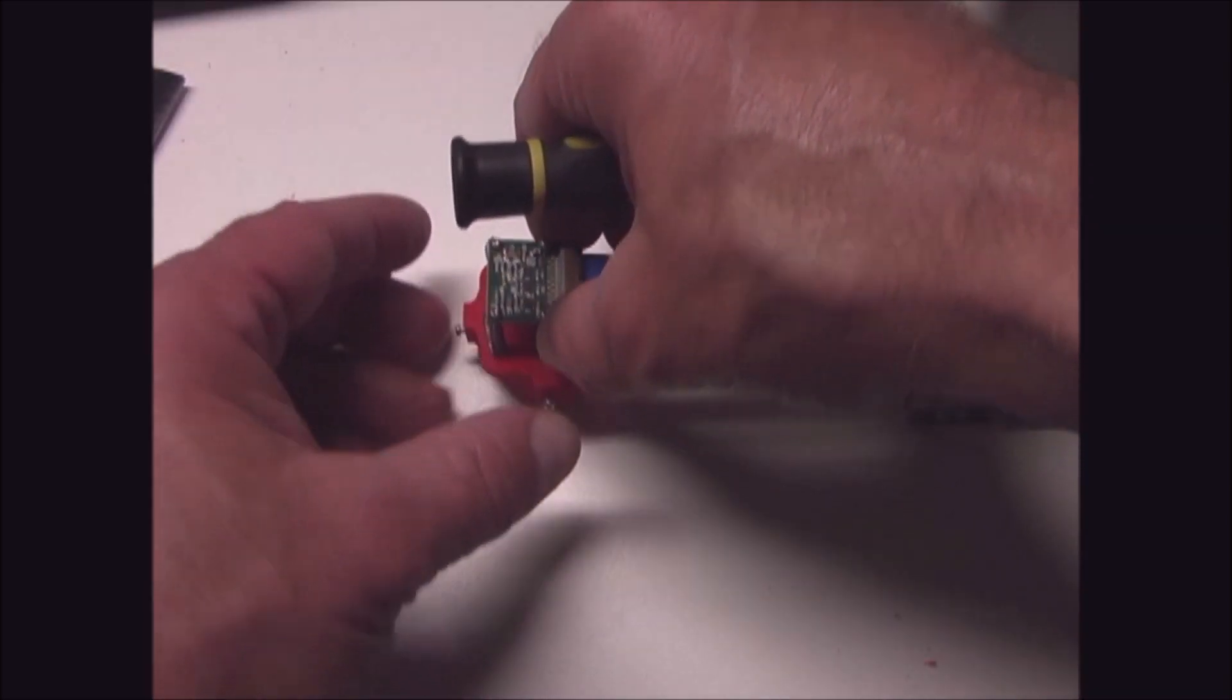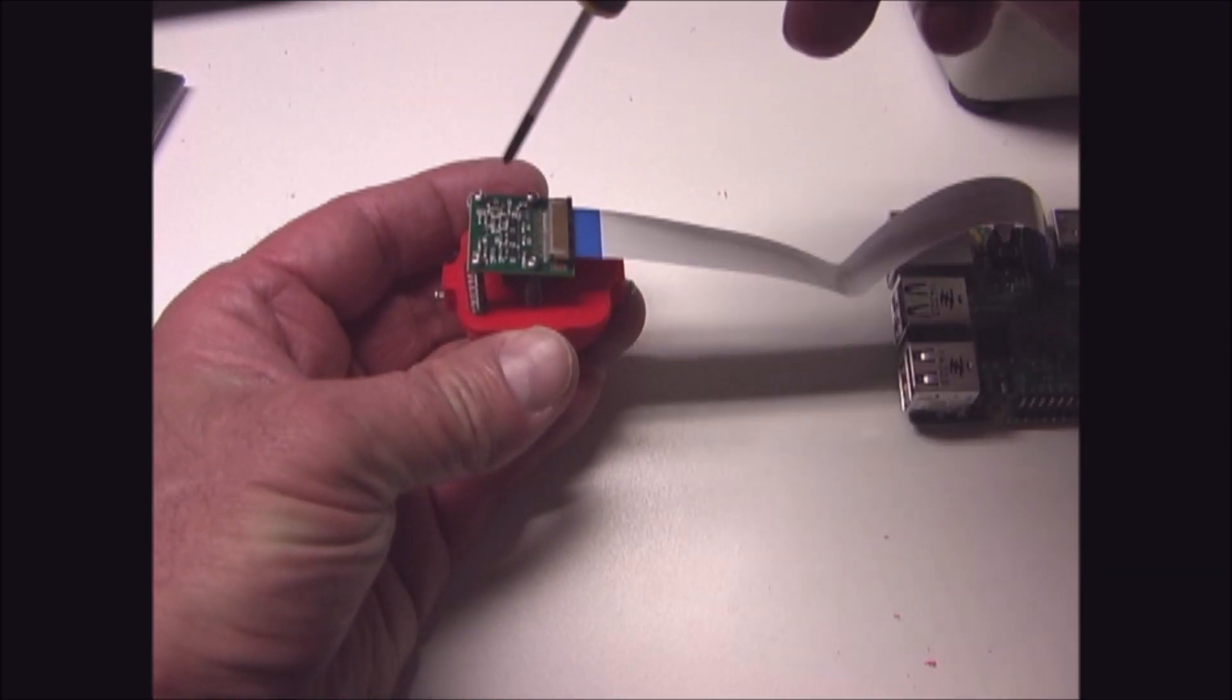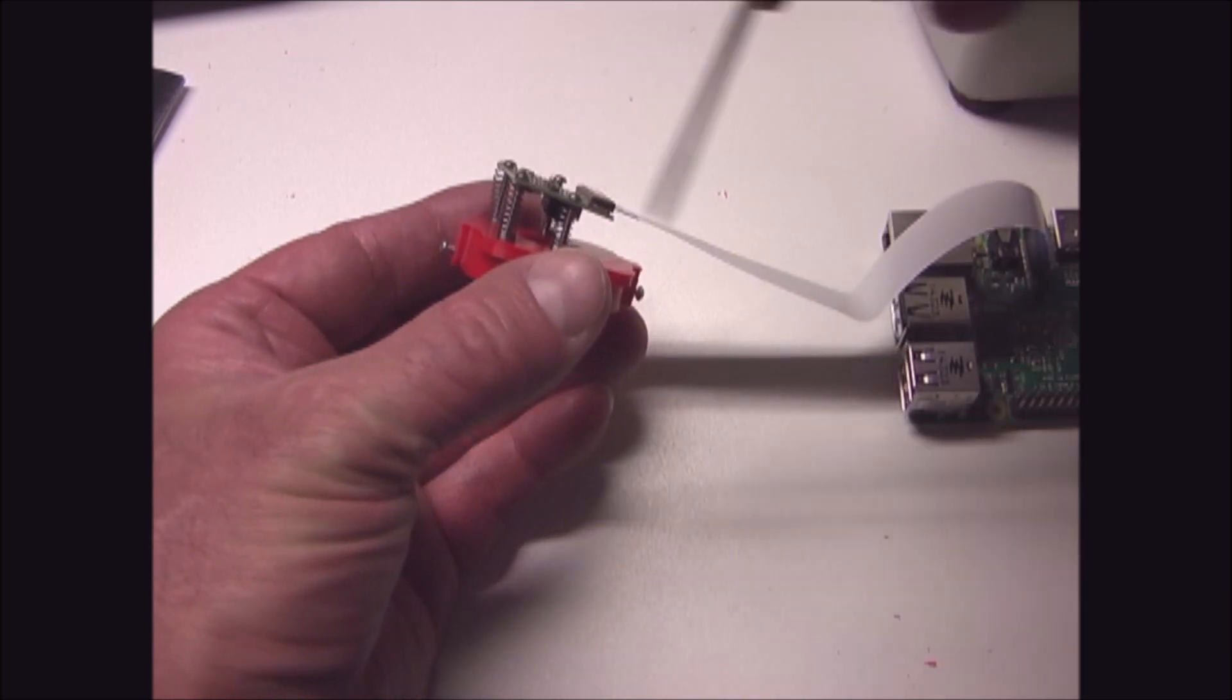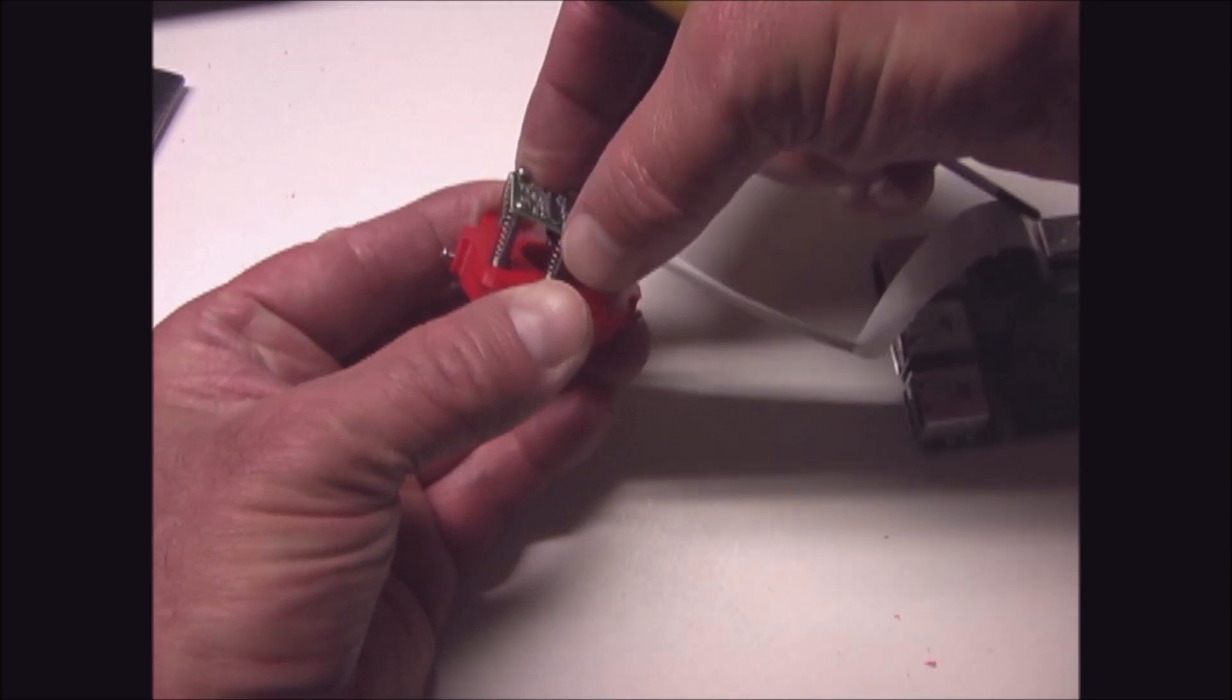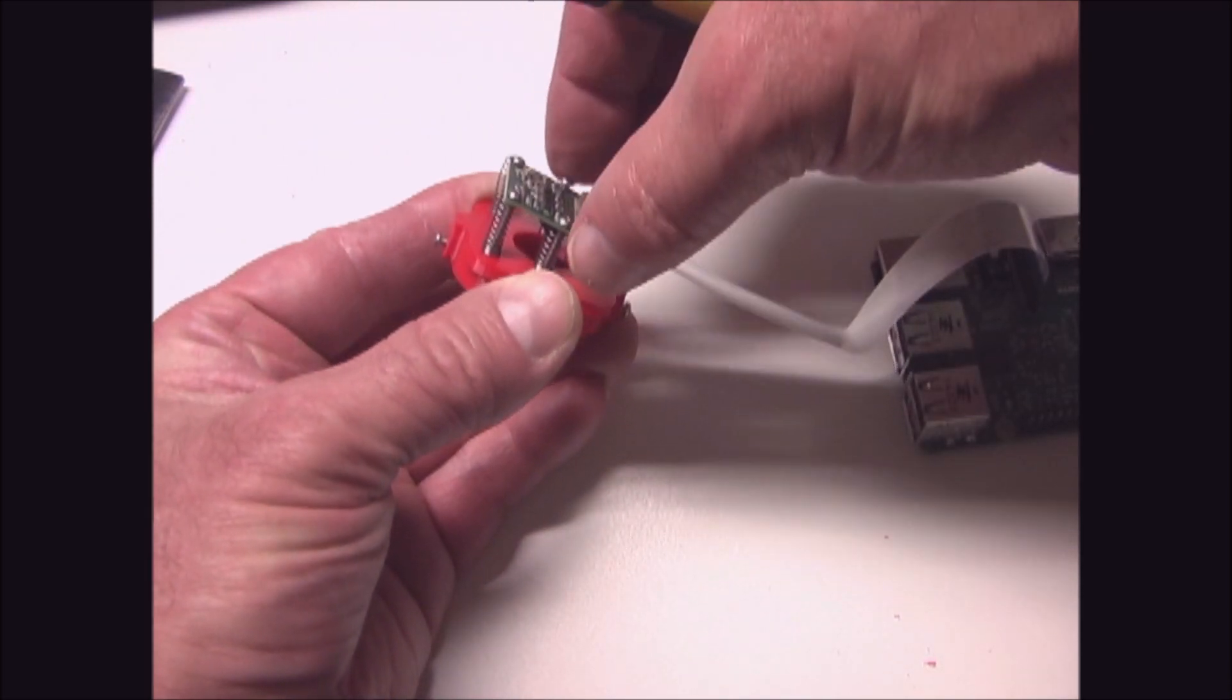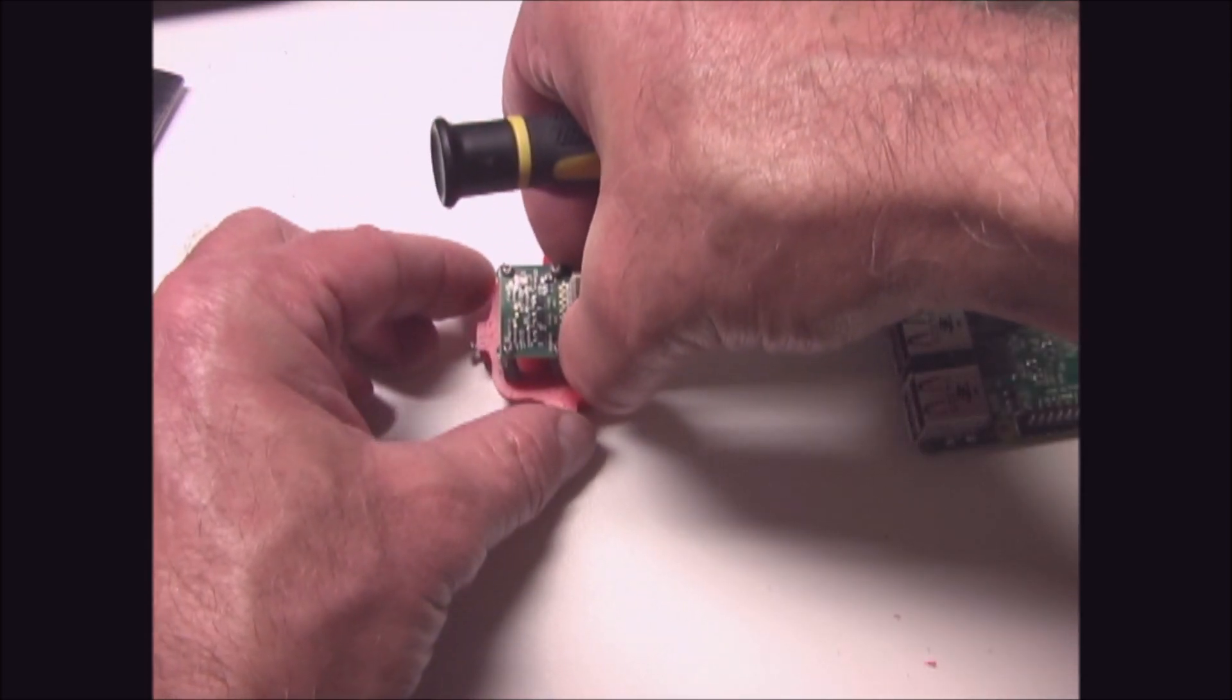The camera is attached to the 3D printed mount with 4 screws. Between the camera and the mount are 4 springs. This allows me to adjust the camera left and right and up and down so I can focus the camera correctly.